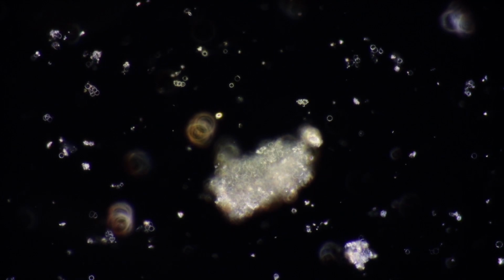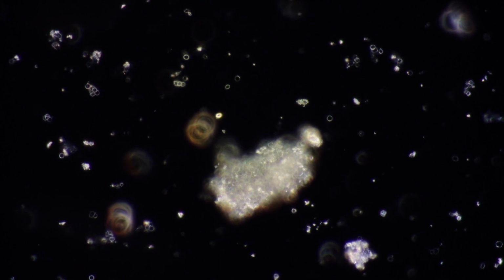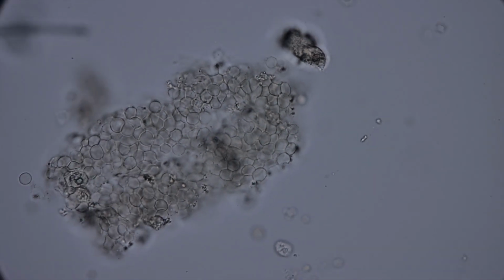You can differentiate dysmorphic red blood cells and acanthocytes using dark field microscopy when you don't have phase contrast available.